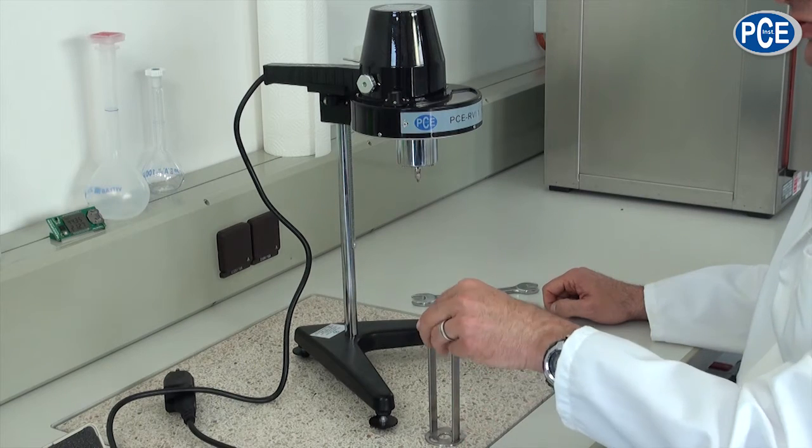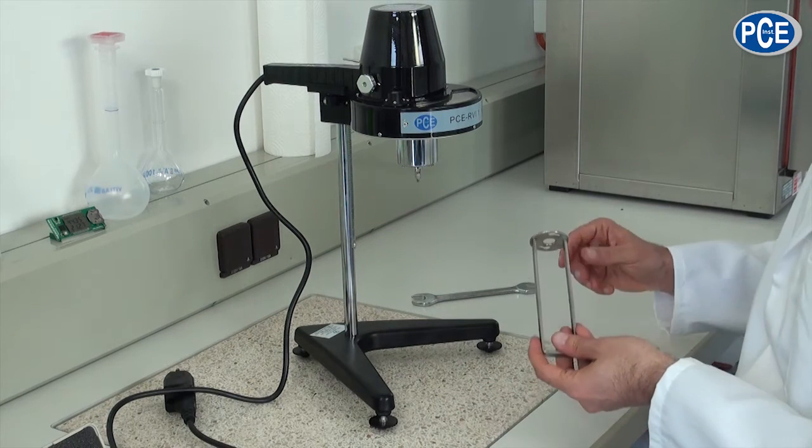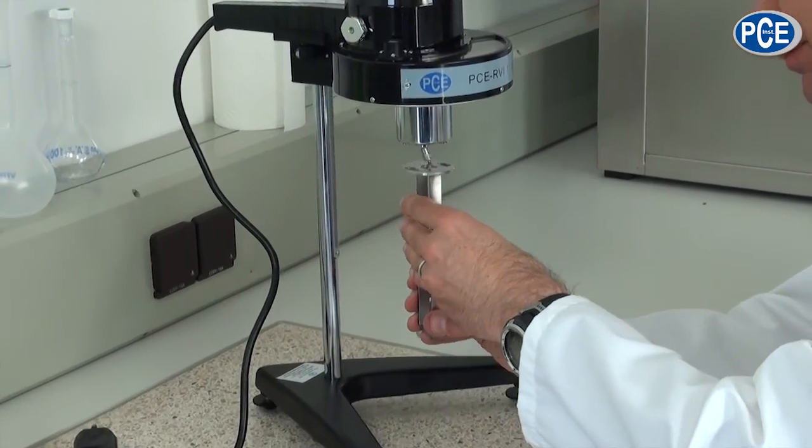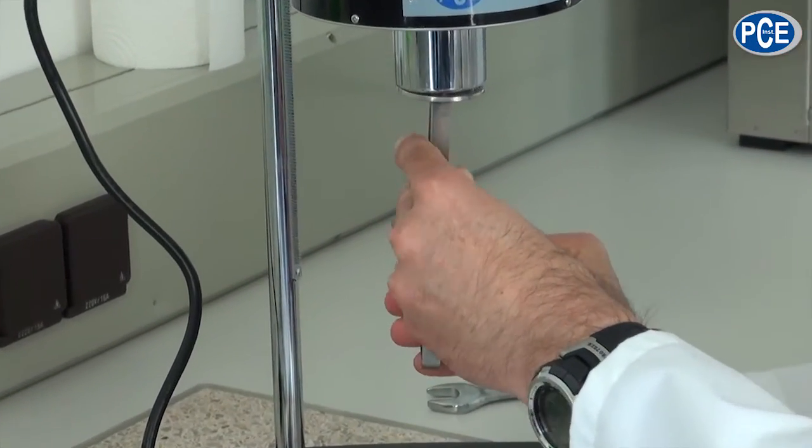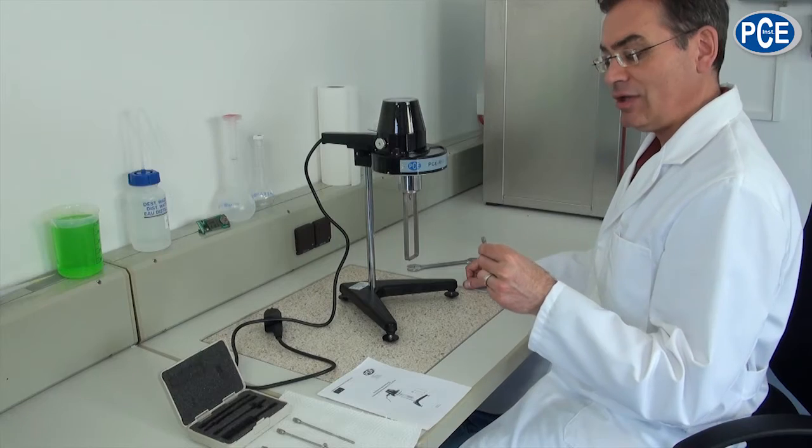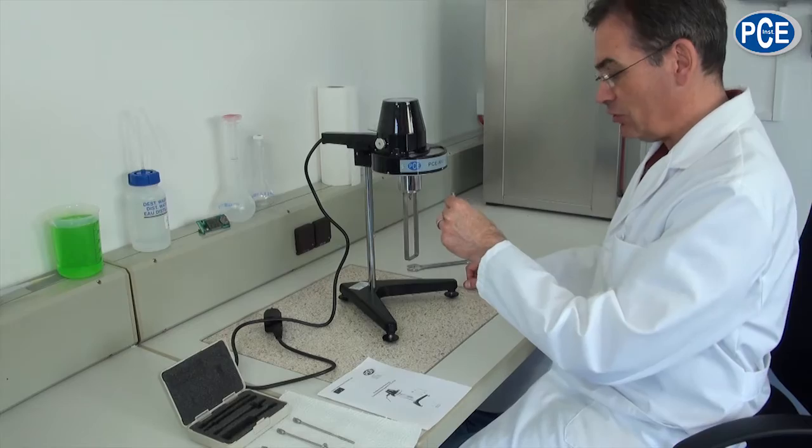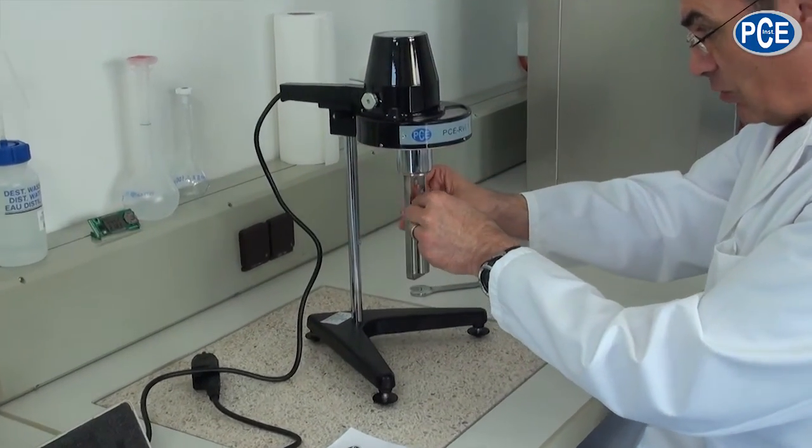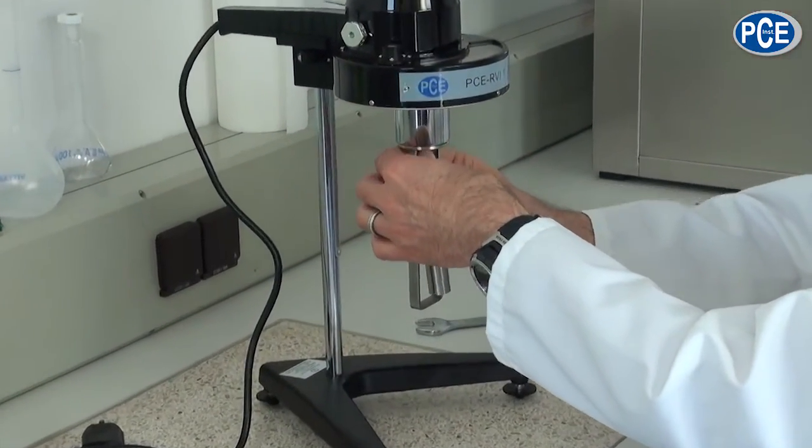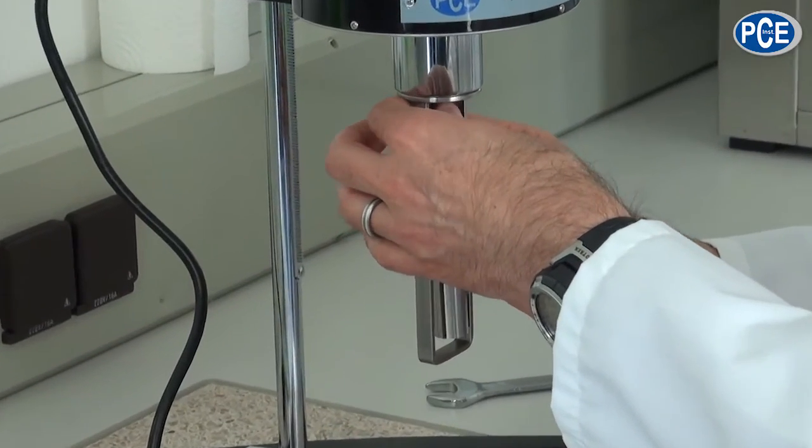In the next step the rotation cage is simply hooked in. In the next step the chosen rotation body is screwed in. For this the shaft is held up a little and the rotation body with a turn and movement fixed.